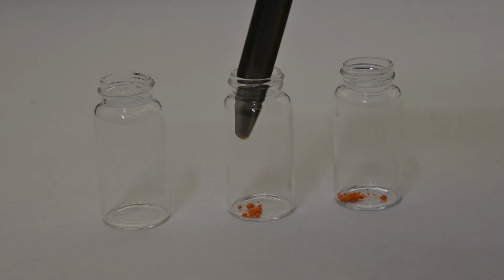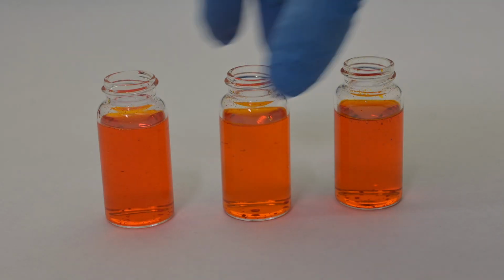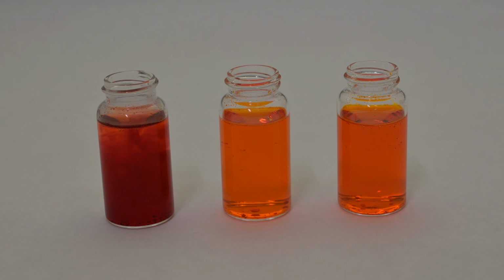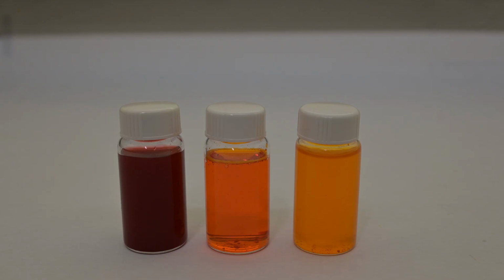To test the indicator properties of the methyl orange we made, I dissolved some methyl orange into 3 vials of water. Next, to one of the vials, I add some acid. This turns the methyl orange dark red. To another, I added some sodium hydroxide, and this turns the methyl orange a yellowish color. In the middle, we see our normal orange color that we got from just dissolving it in a neutral solution.